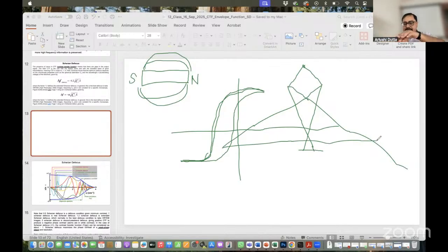So what you are changing is the magnetic field. What I told you at that time was that sometimes you have to go to very low mag, and then you have to go to very high mag, because if you are at a very high mag, it will be very difficult to find what you are looking for. So you have to be at a very low mag.